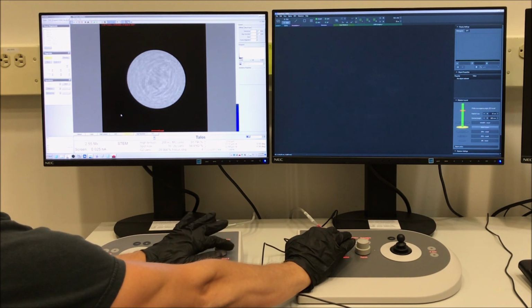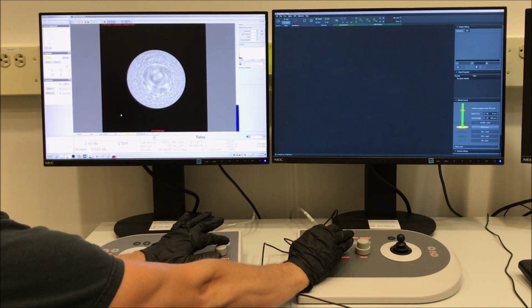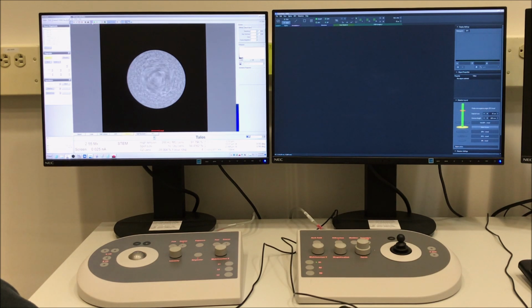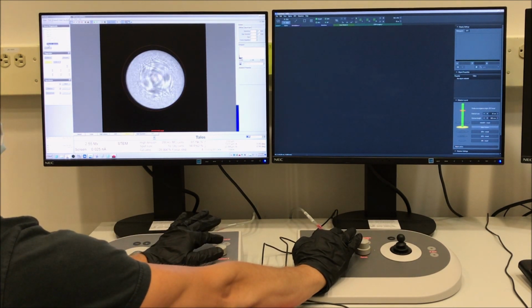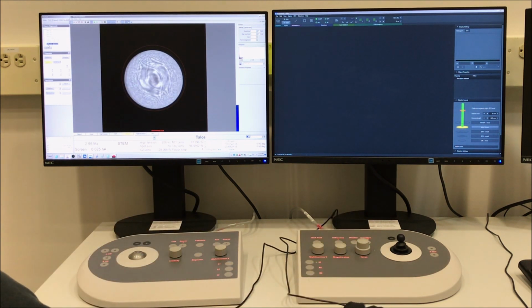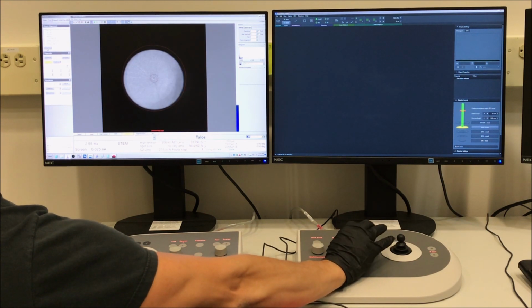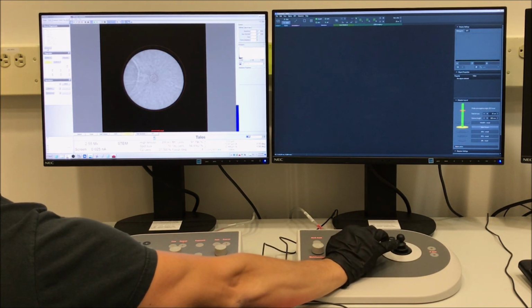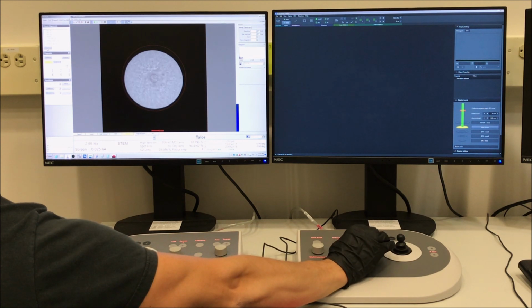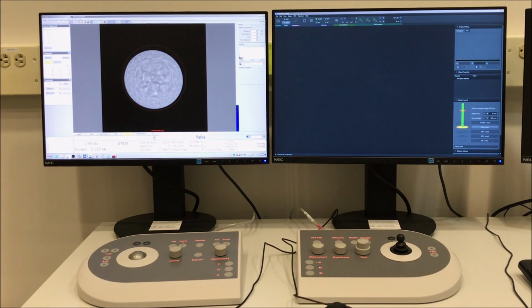If we go to the Tune tab in Microscope Control, you can navigate to the Stigmator control panel and select Condenser. When you do this, be sure to select Condenser and use your multifunction knobs to make the rings circular. We will have to make another adjustment to the stigmation in the final image, specifically when we're doing atomic resolution imaging. If you want to shift the Ronchigram on the FluCam image, you can select Diffraction Alignment from the Direct Alignments control panel and then use your multifunction knobs to shift the Ronchigram around. Then I just defocused the probe because I was looking for an area that was a little bit more amorphous, and I found one here, and then I refocused the probe.